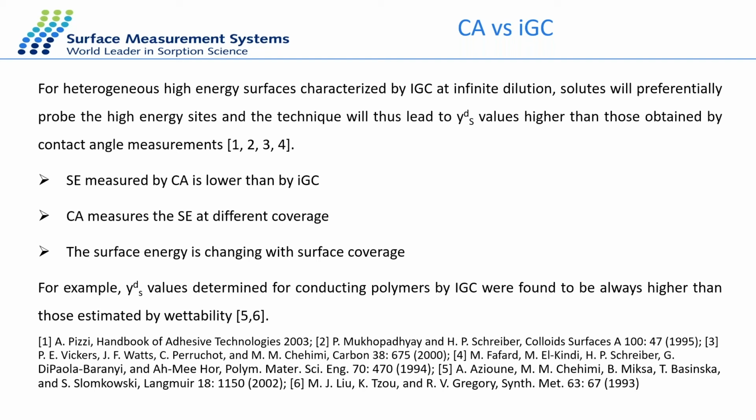So it means that the surface energy measured by contact angle is lower than by IGC, because with IGC you can probe the high energy sites and you can measure the highest energy sites.